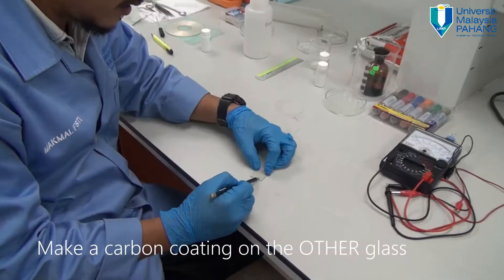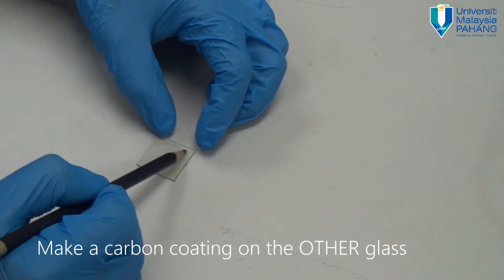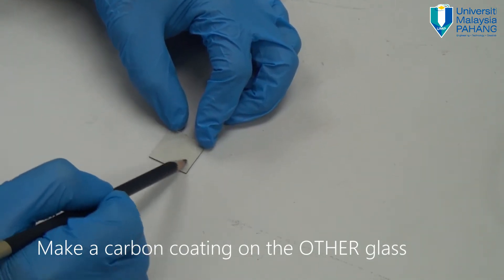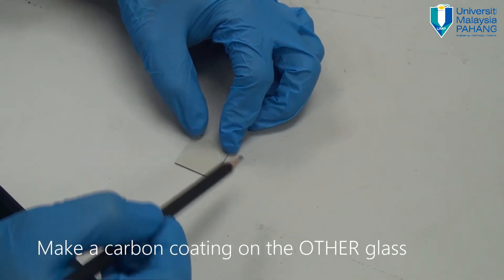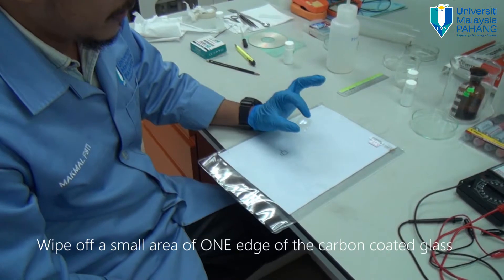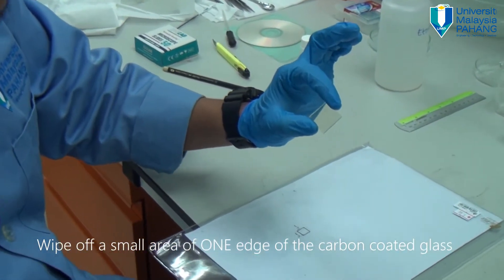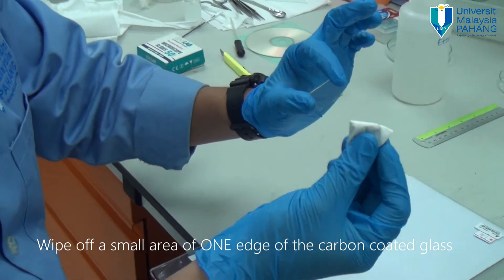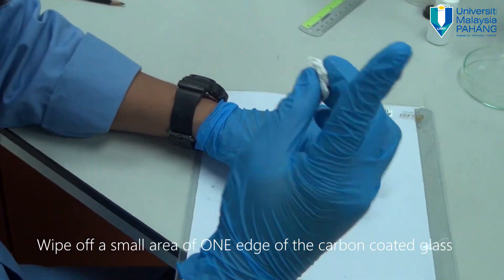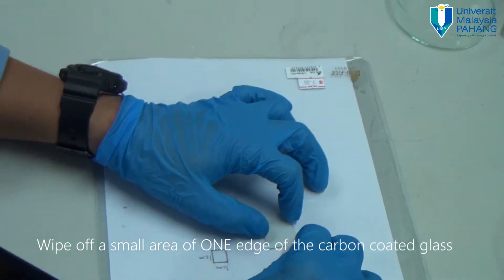What we need to do is coat the glass with the pencil until you see carbon starting to deposit on the surface. Keep doing this using different angles — switch the angle of the conducting glass. This is how the surface looks after being coated with carbon using a pencil. Then take a piece of tissue paper and wipe off a little bit of one edge only, to make electrical contact later.